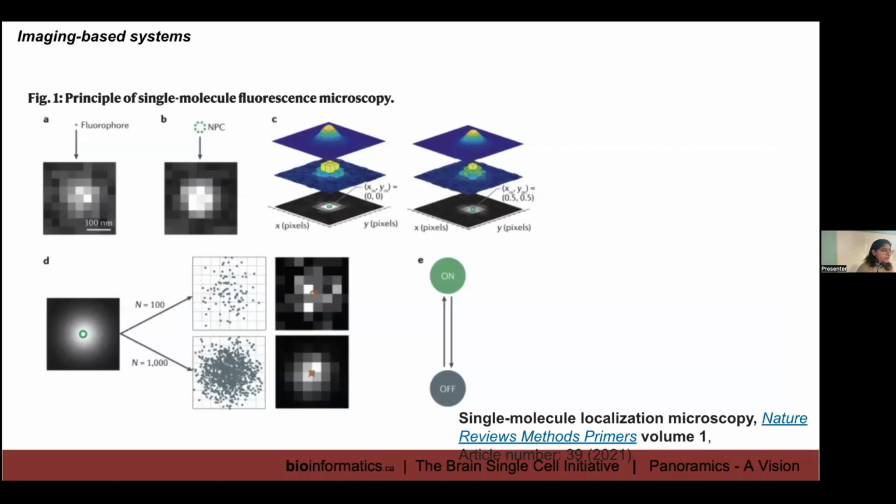So for the practical, I have also included a Xenium data set because I think you need to understand, if you're doing spatial, that Xenium is an example of a single molecule imaging-based platform, and this is a sequencing-based platform. The scale is different still, even though both measure subcellular resolution.